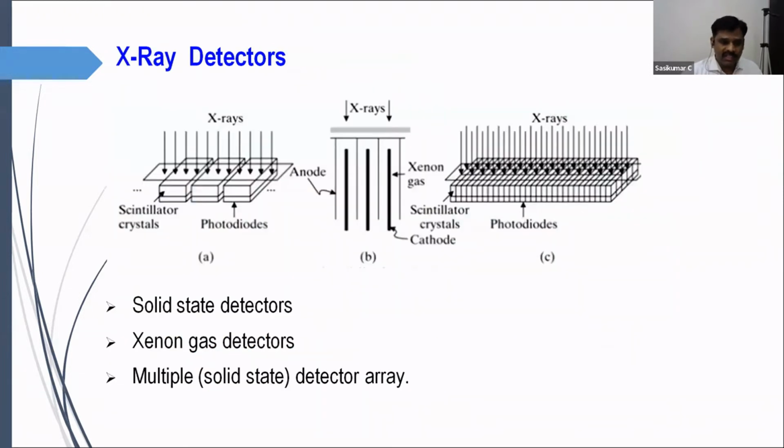And once the X-ray is coming out, now we need to analyze it. We need to detect it. So there are detectors. These detectors will analyze the X-rays which are coming out. There are detectors like a gaseous detector, solid state detector, and many other types. In older technology, they were using the ionization principle. X-rays will be ionizing the gaseous atoms. You measure or quantify the ionized species, and thereby you can quantify how much X-ray is emitted.